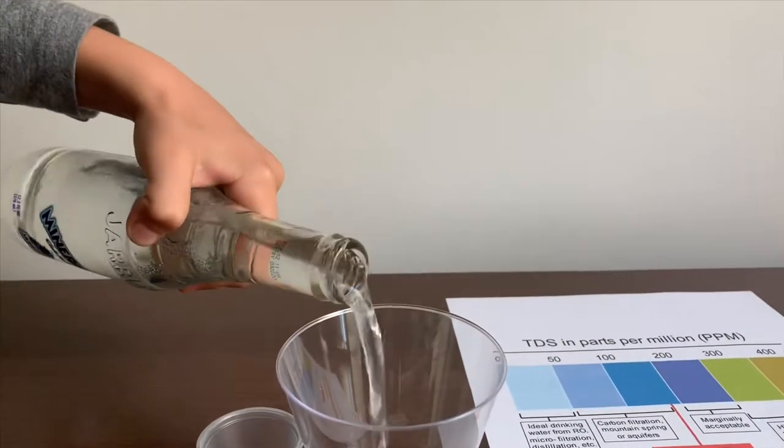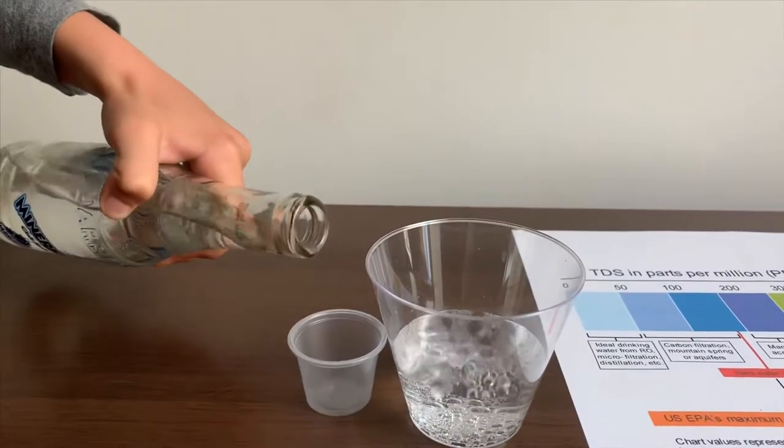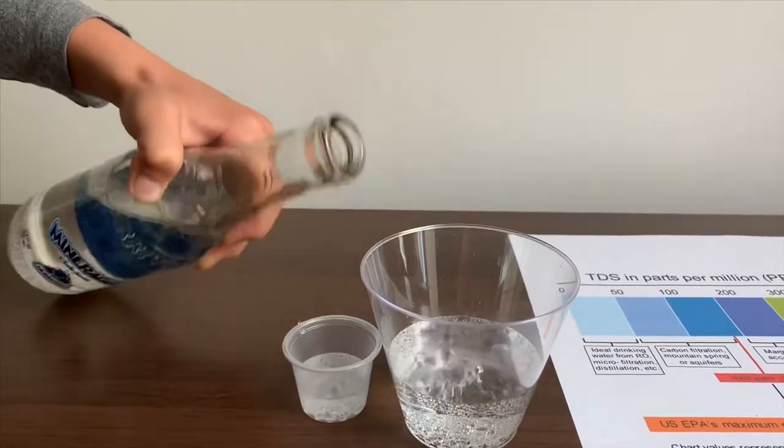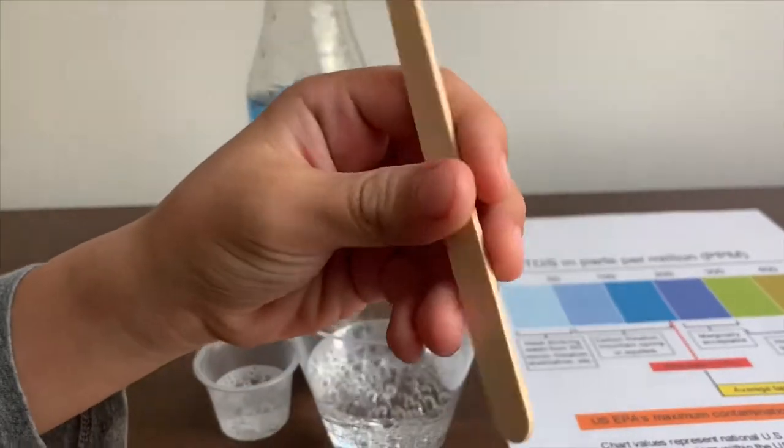Let's pour some water in. Let's stay all low so we'll get a better result on the TDS.